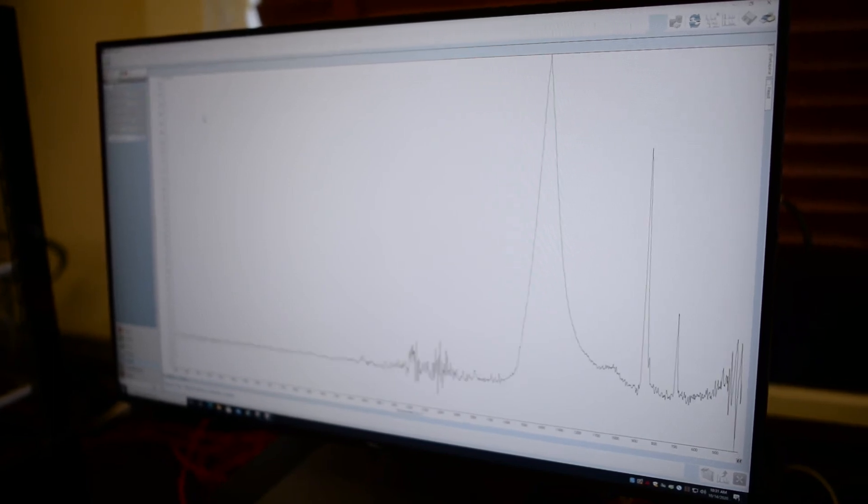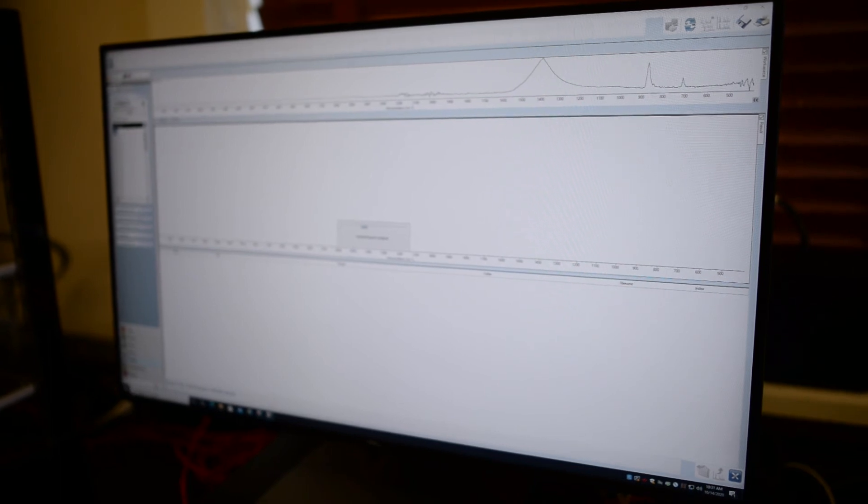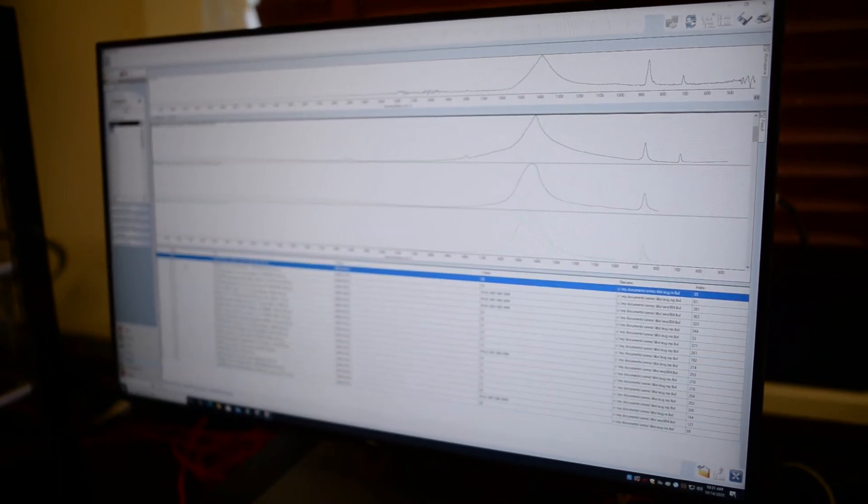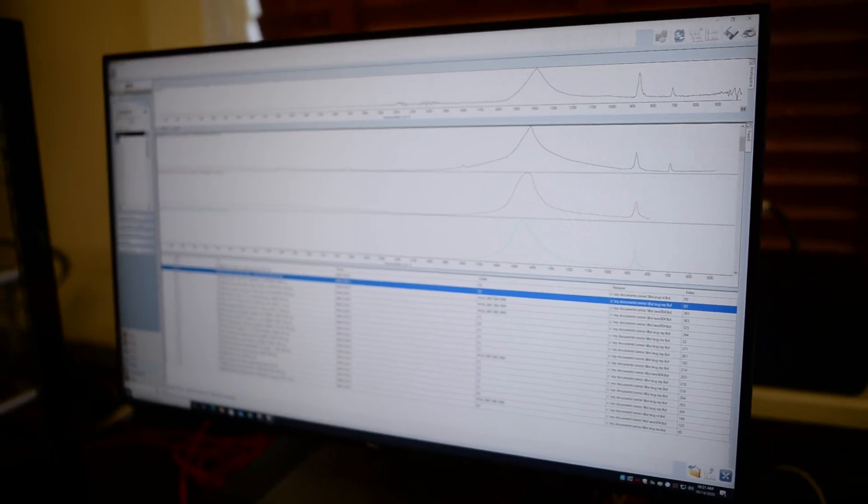It doesn't really take long to do this. As you can see, it's already done. It's going to pop up matches. And so if we look on the list, our actual first match is calcium carbonate, which we know is in limestone. So it has identified one of the components in limestone.